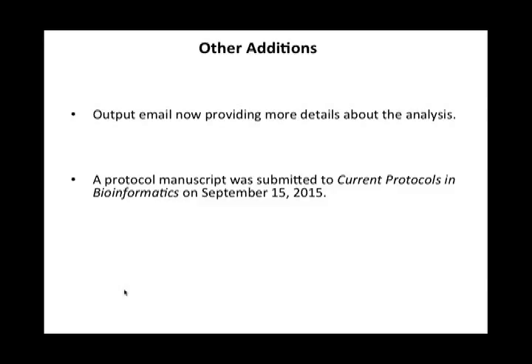an online experiment repository where a given lab can store all of its mass spectrometry-based results in order to integrate them, but also query them using some sophisticated queries, to see if a protein came up in different experiments from different users. So everything is integrated into that repository, and we wanted to be able to analyze the data sets in that repository with PSEA-Quant without having to download them and resubmit them to PSEA-Quant.